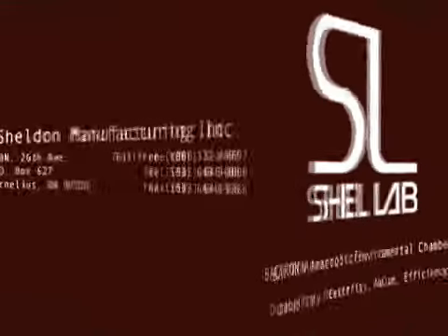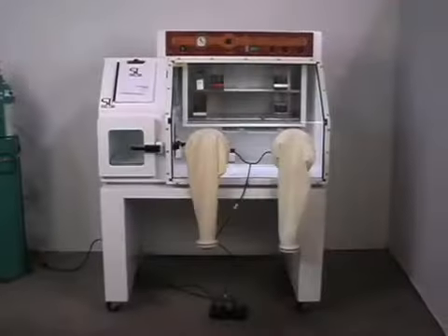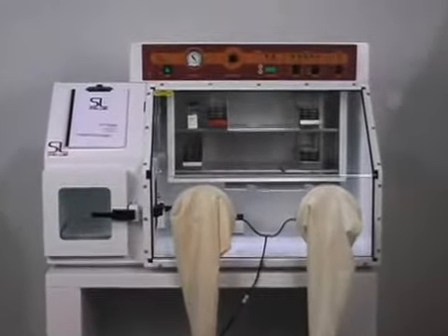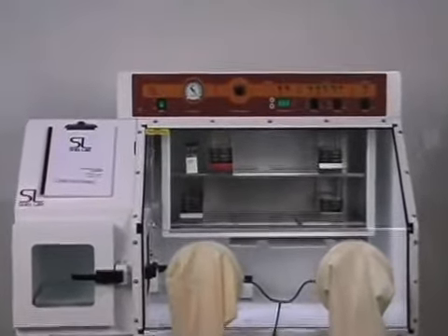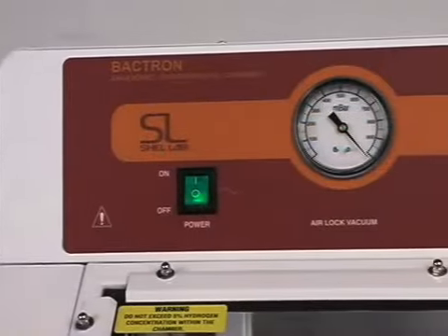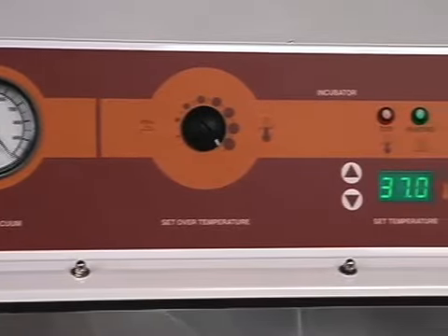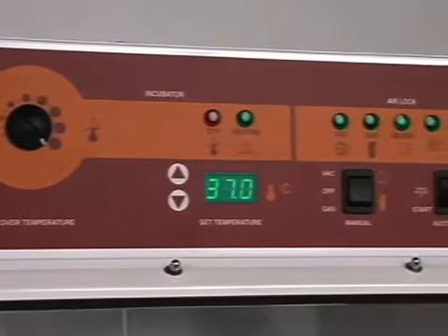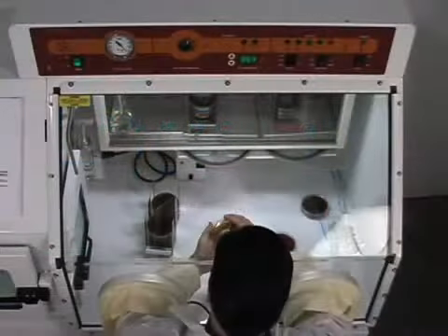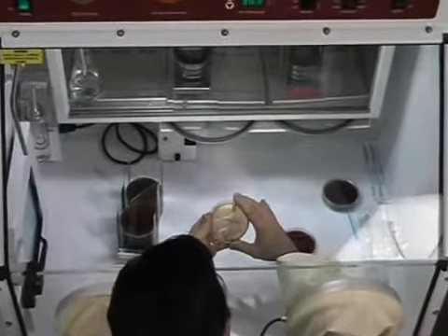Year after year, the Bactron line of anaerobic chambers has been the most durable, reliable, and innovative solution for microbiologists worldwide. The Bactron III continues this tradition from isolation and incubation to identification. The Shell Lab brand Bactron Chamber employs microprocessor controls with pre-programmed cycles that ensure repeatable, efficient technique and monitoring while entering and exiting the chamber. The Bactron's unique features not only improve functionality, but make it the most comfortable anaerobic chamber to work in.